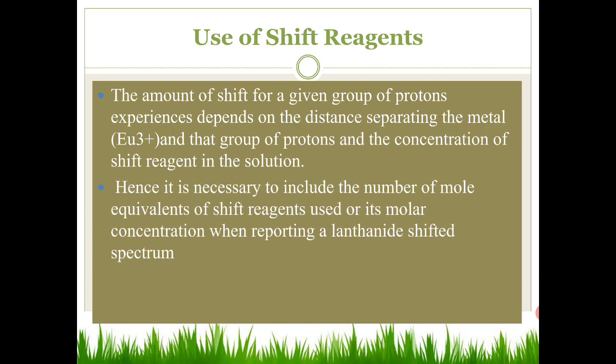Hence, it is necessary to include the number of mole equivalents of the shift reagent used, or its molar concentration, when reporting the lanthanide shift spectrum. This is a very important point. The amount of shift depends on the distance separating the metal and the group of protons. The distance is important, and so is the concentration of the shift reagent, so you need to show it when you are expressing the shift.